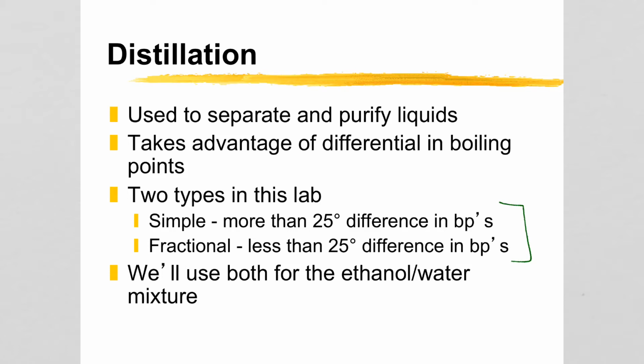You'll see that ethanol and water, which are the main components of the mixture you'll be separating, are pretty close to this line right here, and we're going to use both techniques to separate this mixture.